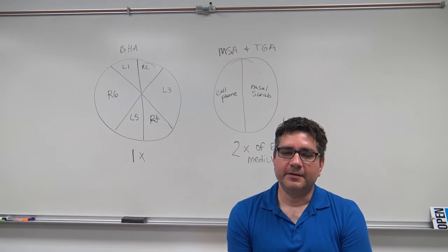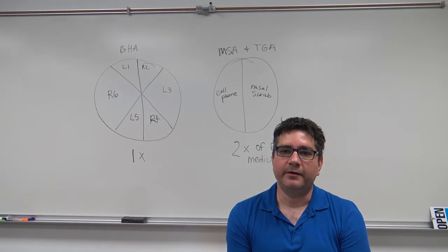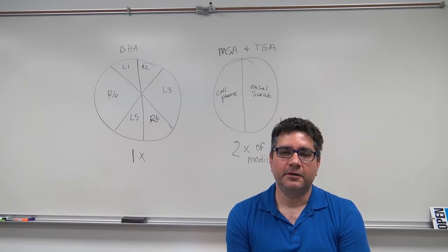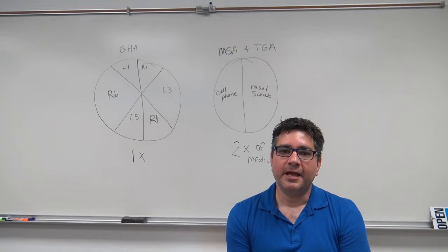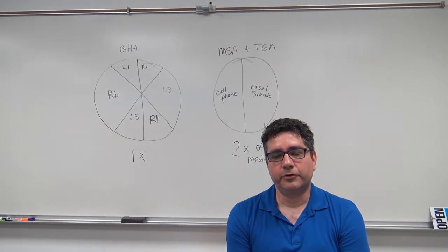Before we go into the different types of media we will be using today, let's first discuss what resident and transient flora are. Resident flora are, as you guessed it, residing in or on our bodies. Resident flora serve a purpose for each of us and are present on and in the various parts of our bodies. Transient flora are those organisms that we may pick up from our interactions with others and the environment that are not normal residents of our bodies, but that become part of our flora for a short period of time.